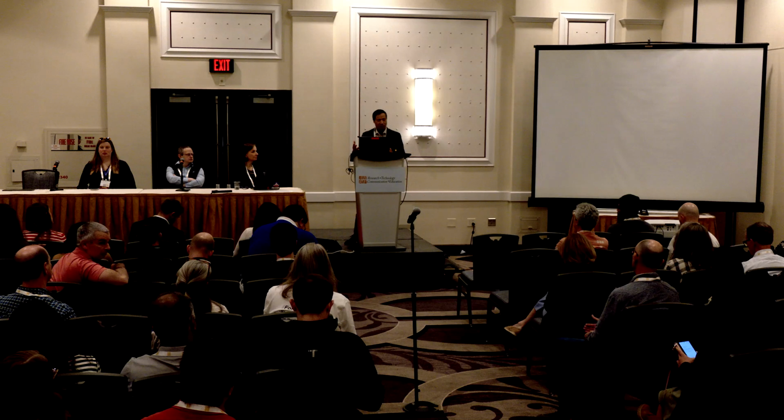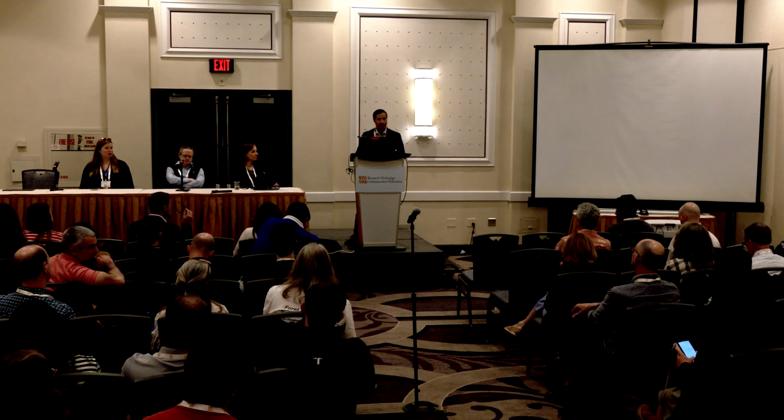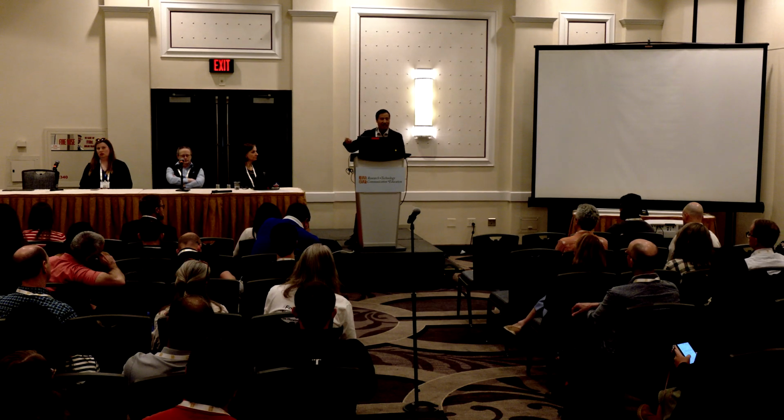I'm grateful for tools like those that were just described, that can manage some of these pieces, and we're especially grateful for really vital communities that create community standards around metadata, like OMERO and some of those sophisticated frameworks. But there are a lot of disciplines that don't have that kind of sophisticated community that emphasizes metadata standards and sharing and life cycle tracking and provenance of data. And for those situations, we really need to navigate for them.